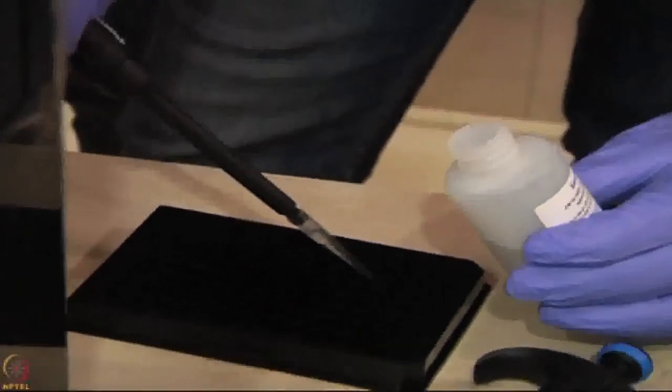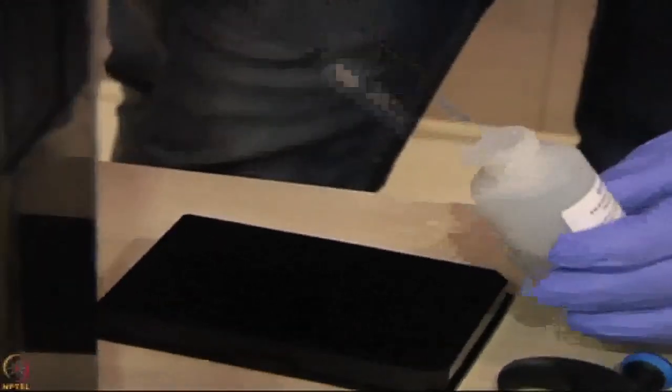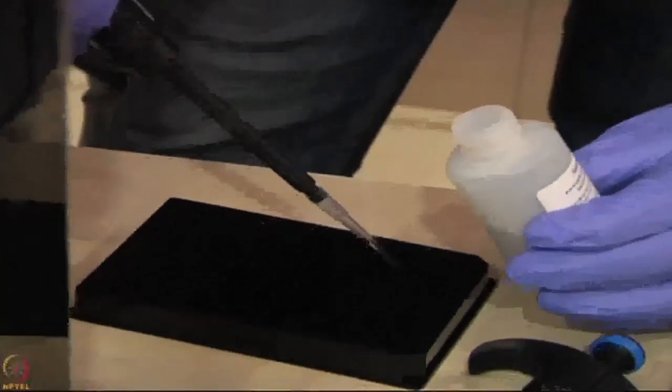The only time-consuming part is making the plate, that's all. The rest, once you make a program, is unattended, you just leave it. You didn't add any H? No, not required, just up to G, that's good enough, not H. We are doing it with the 7 sensors.